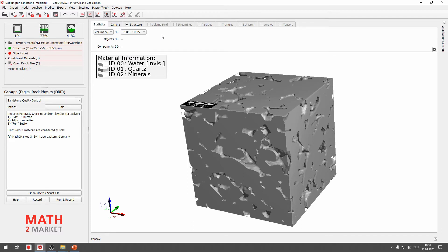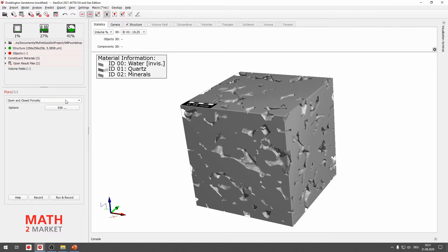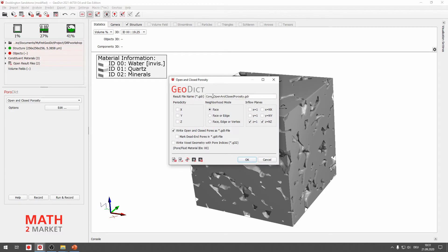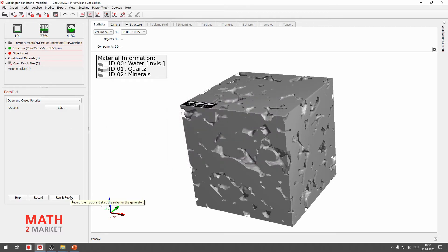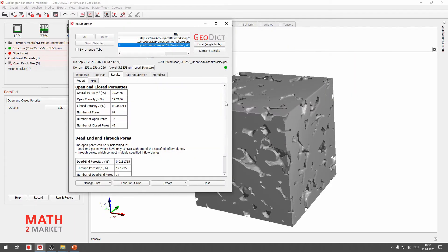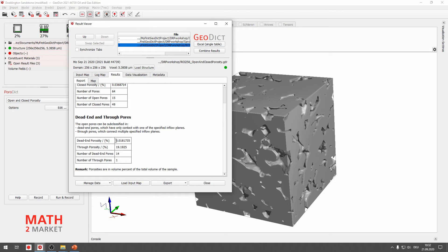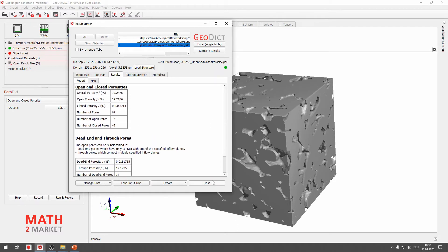There's also the option to use the PorDict module. Please go to the Analyze menu and click PorDict. We will go again with Open and Closed Porosity. We can click Edit and change the naming to, for example, ROI Region of Interest 256. Click Run and Record to have it in our macro and get the results. We see the overall porosity is 19.25% and connected porosity is 19.21%, so there is almost no dead-end or closed porosity.